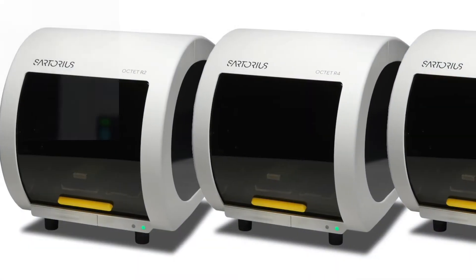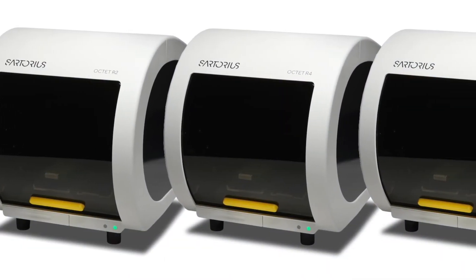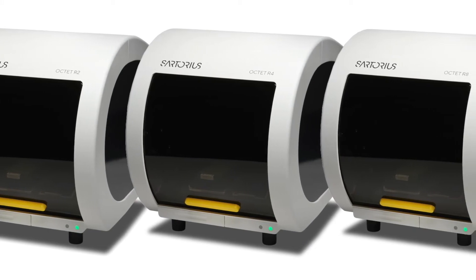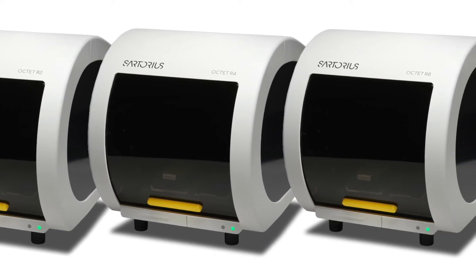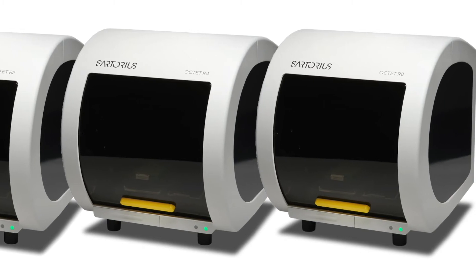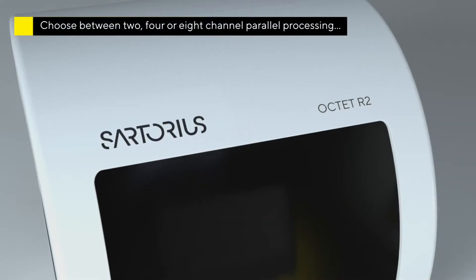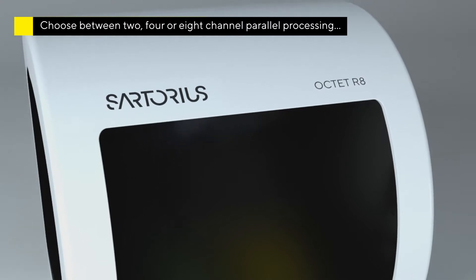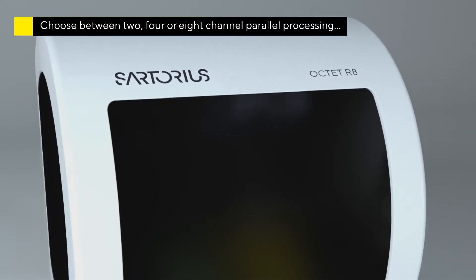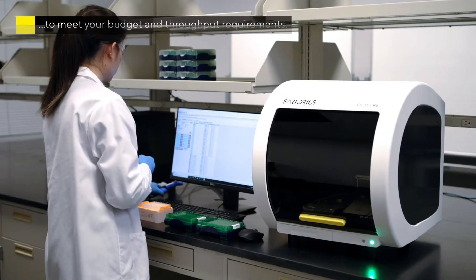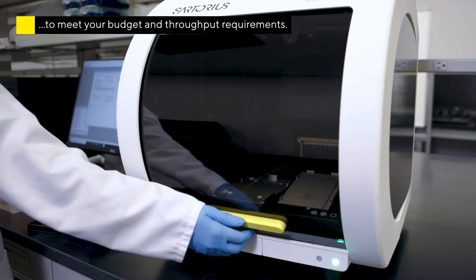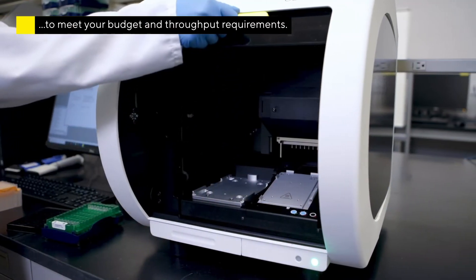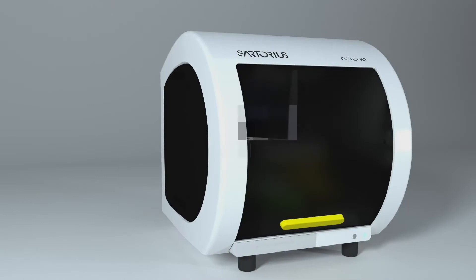Sartorius' latest offering, the Octet-R series, provides a modular and scalable solution for molecular screening in 96-well microplates. Offering a choice of two-, four-, or eight-channel parallel processing, these instruments are designed to provide fully automated walk-away processing to meet every lab's budget and throughput requirements.